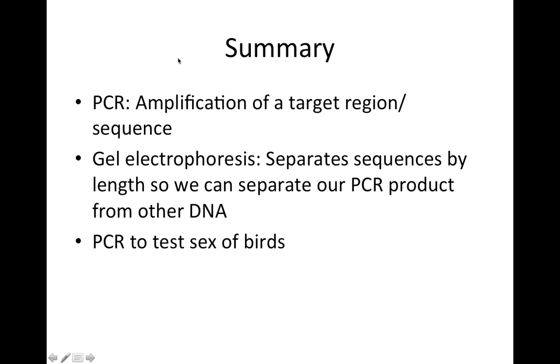Okay, so our summary here, we can use PCR to amplify a target region or sequence. Gel electrophoresis is a method by which we can separate sequences based on length. So we can separate our PCR product from other DNAs. And then we learned how to use PCR to test the sex of birds.